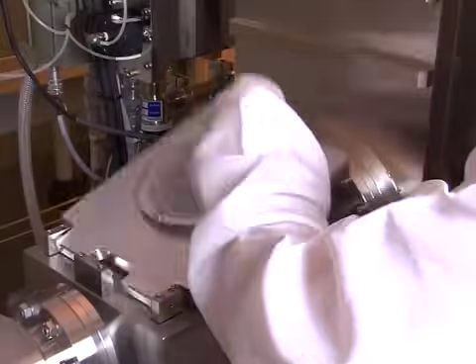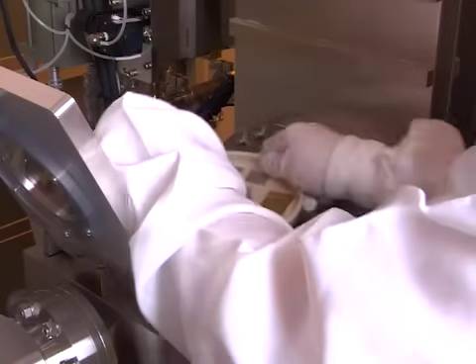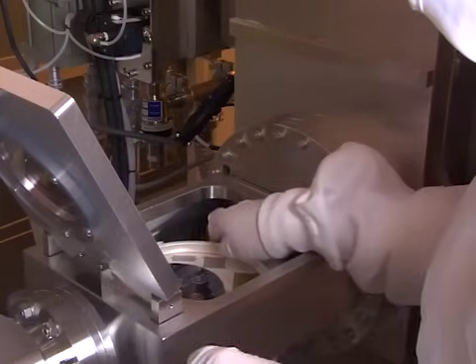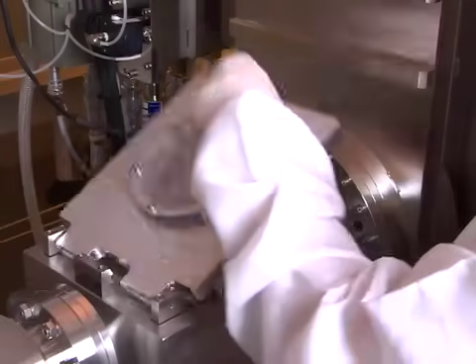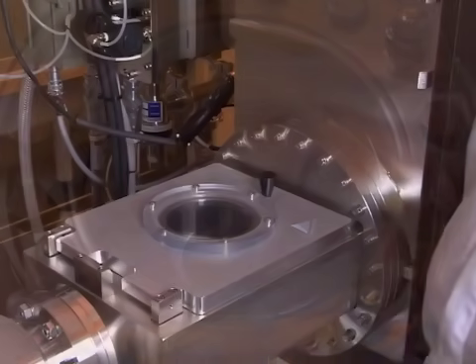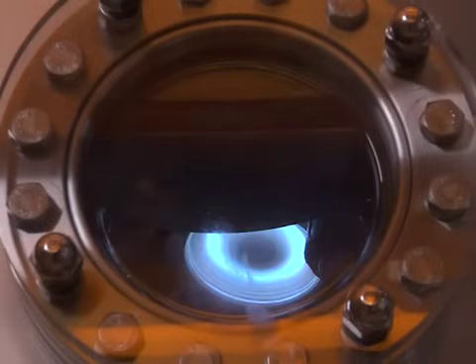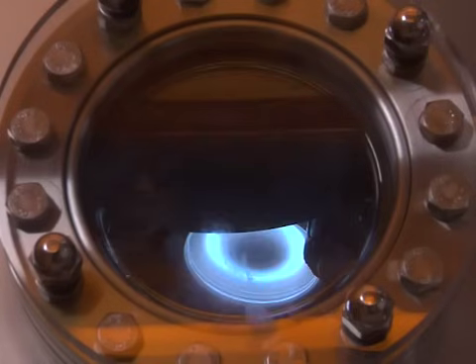Instead of etching away the top layer of the substrate, metal is deposited on top of the photoresist pattern using sputter coating or metal evaporation. In this example, a chromium adhesion layer is coated on a glass slide followed by a gold layer.